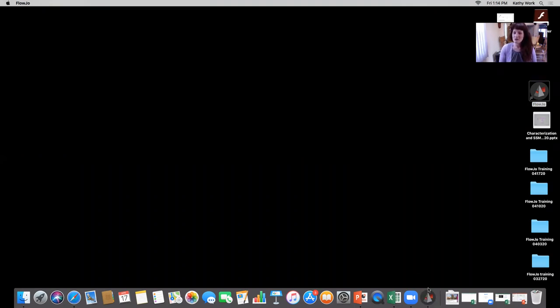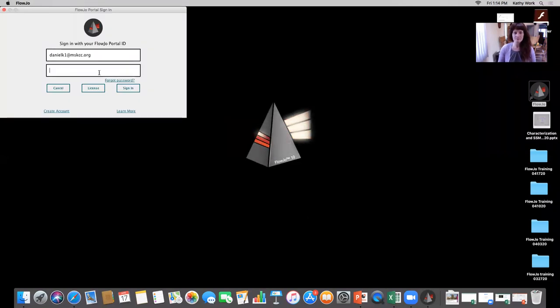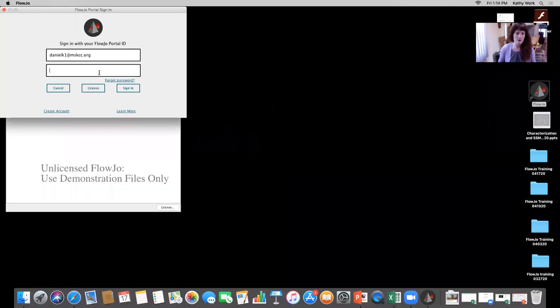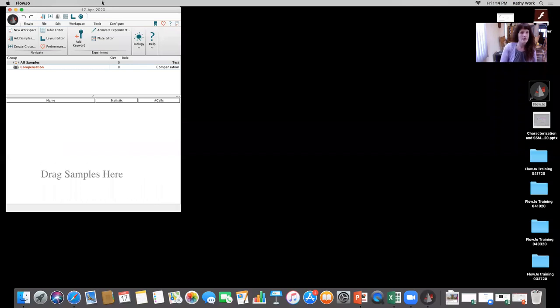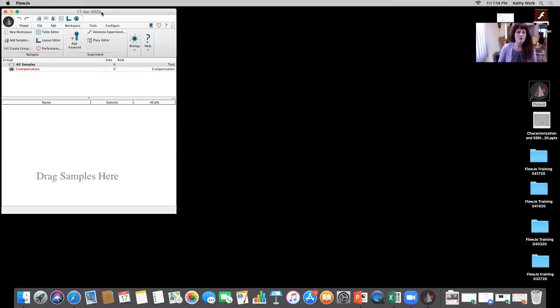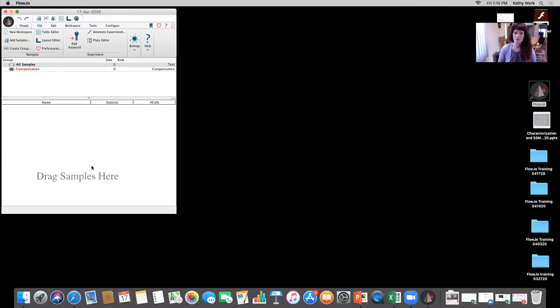For anyone joining for the first time or who hasn't used FlowJo in a while, there's a portal ID sign-in — it's gone away from strictly hardware-based and now everyone needs a portal ID to log in, whether using an individual or shared account. The portal ID itself is free; it's just whether you get a license for an individual or shared account. Once signed in, it goes from unlicensed to a licensed version of FlowJo where you're able to analyze data.